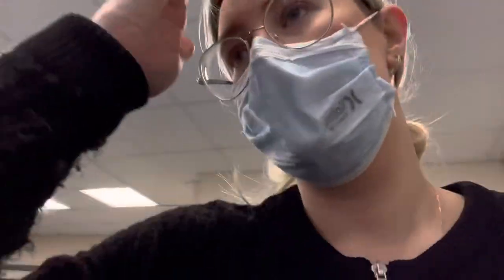Yeah, so today is bioassay day, so I need to be focused this morning. Need to prepare the samples correctly. Need to make sure I put the samples in the correct wells in the 96 well plate. And yeah, I just need to make sure everything goes to plan.